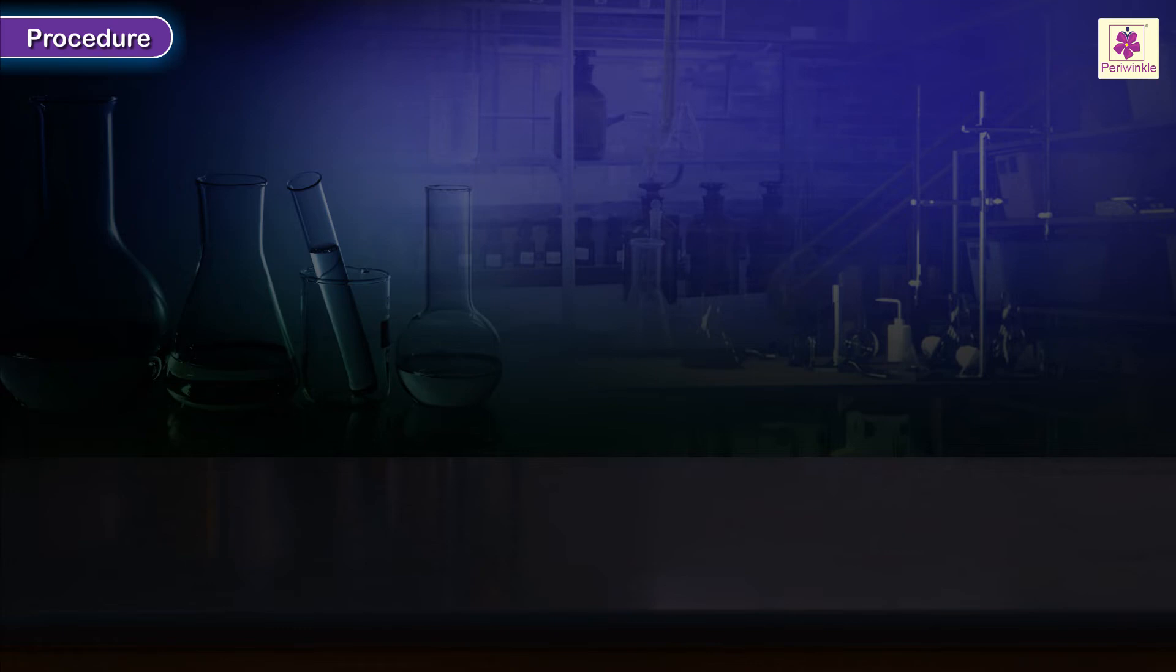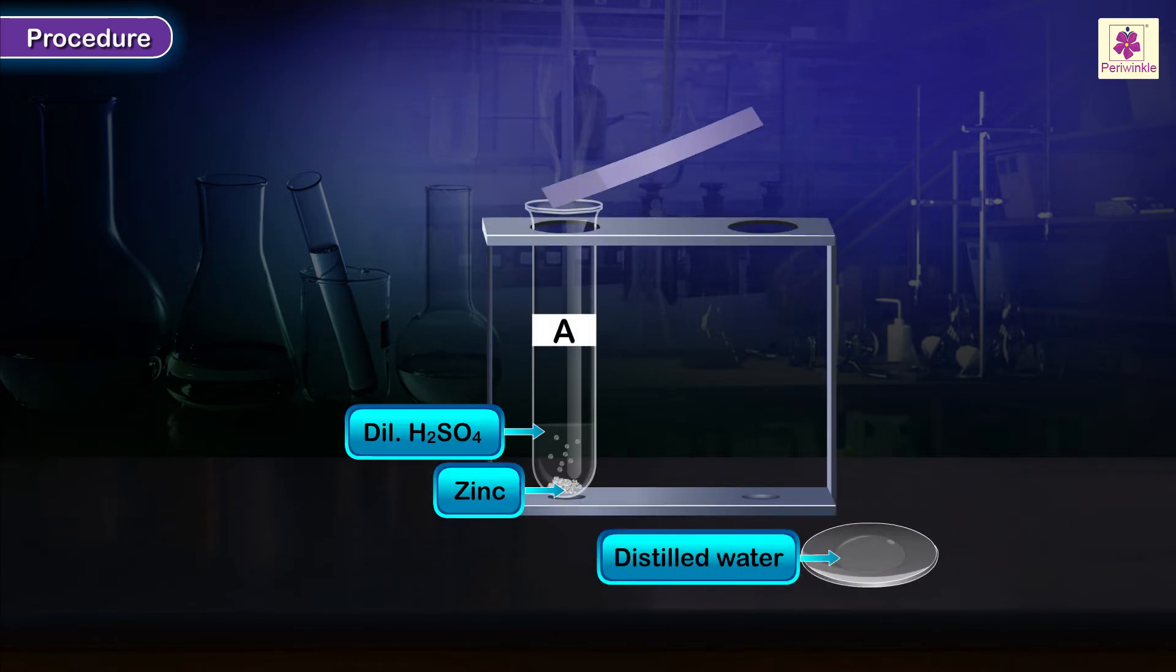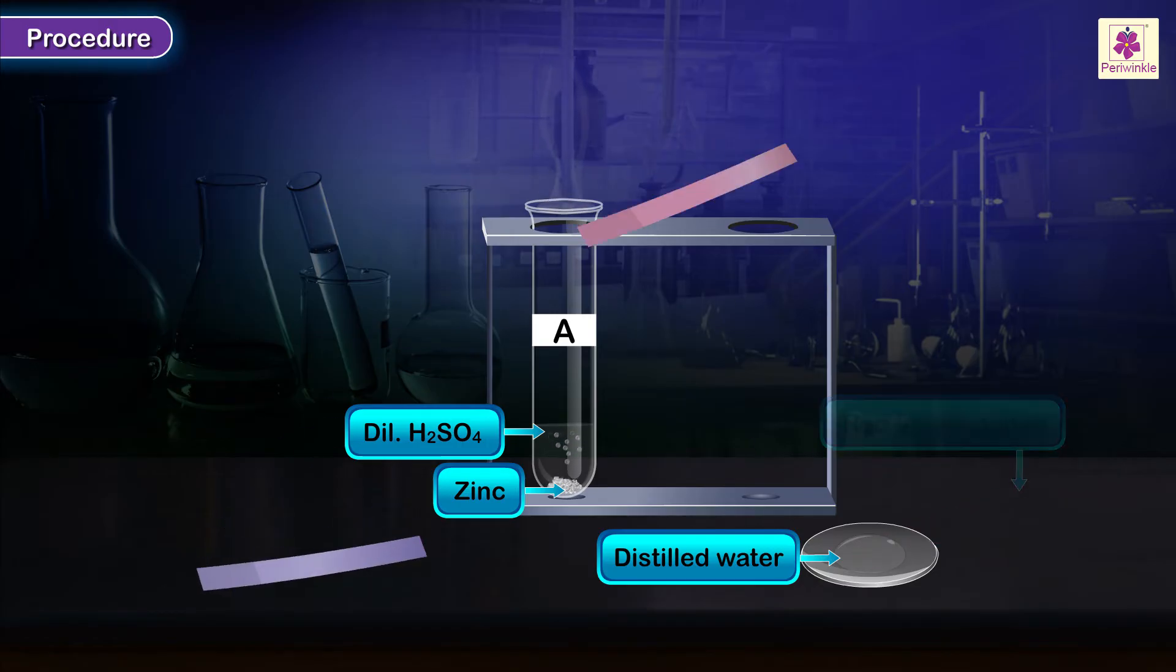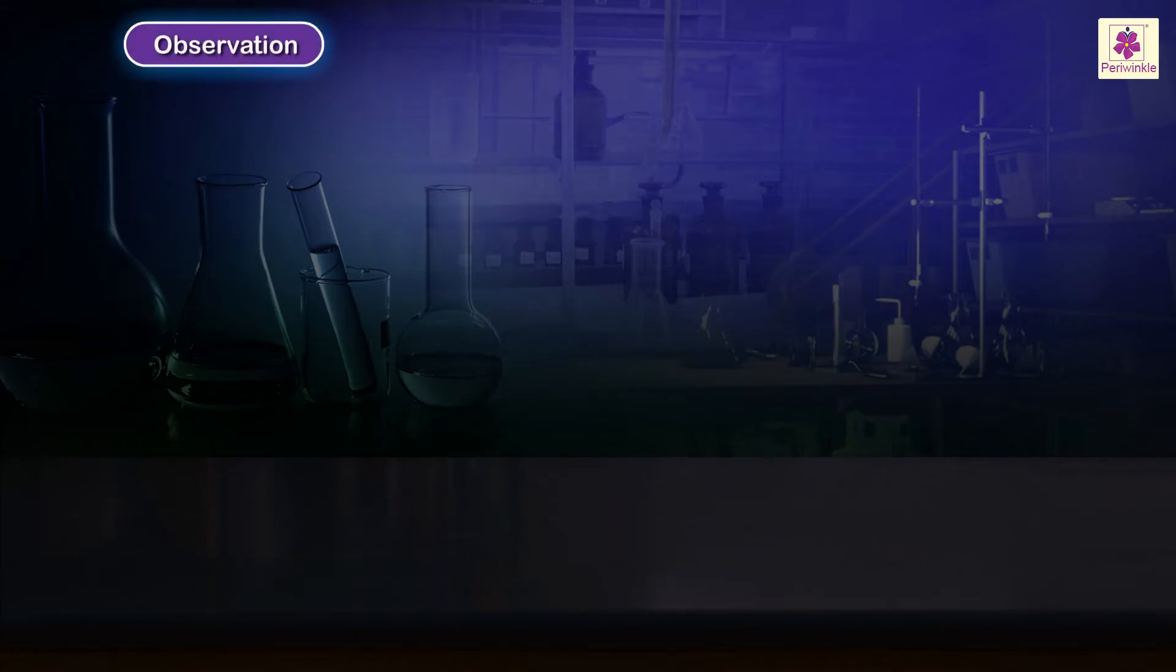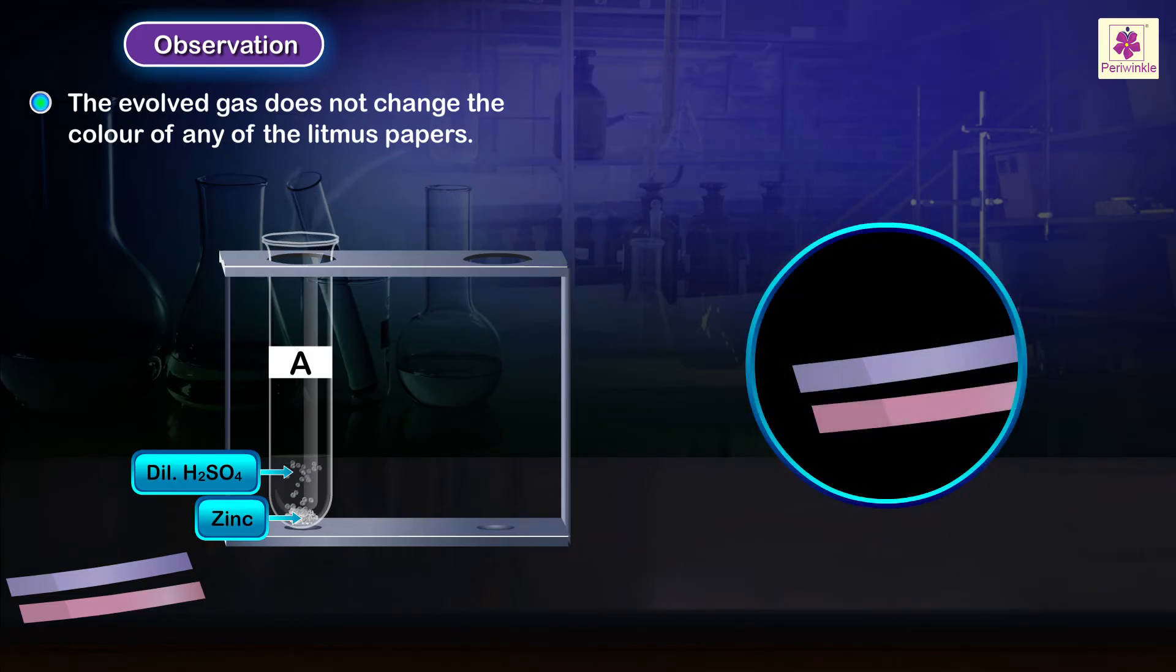Procedure: When the gas evolves in the test tube, hold blue and red litmus papers moistened with distilled water at its mouth. Observation: The evolved gas does not change the color of any of the litmus papers. Inference: The gas is neutral.